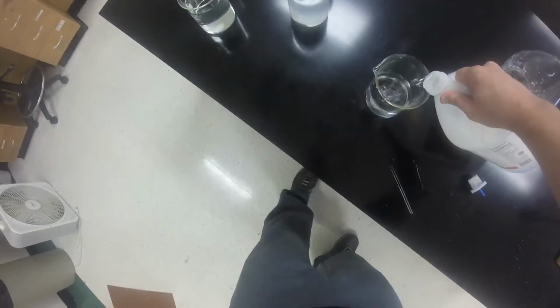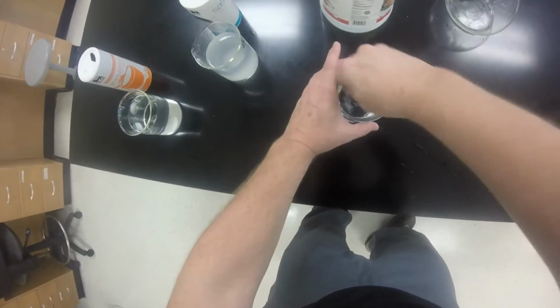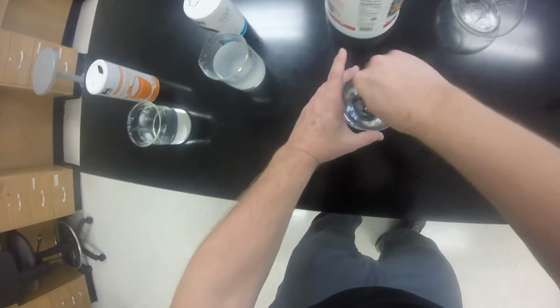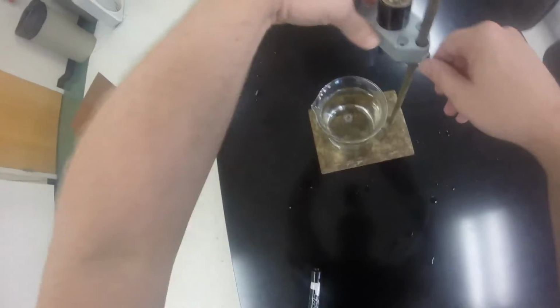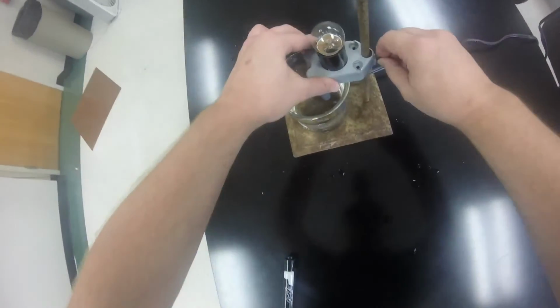So let's add a lot of our acetic acid. This is only 5%, so really it's mostly our water, very little bit of our acid. So let's try this mixture. So remember, weak electrolytes, most of them are not our charge carriers. Only that very small fraction that actually is going to break apart is going to be our charge carrier.